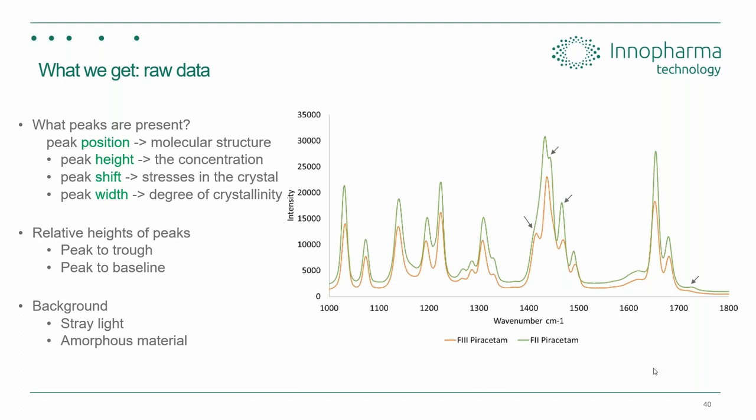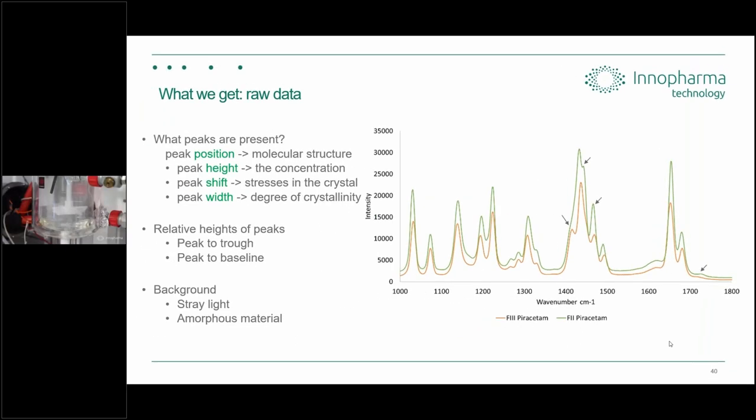Okay, interesting. Right, so what we're starting to see now in our experiment, we'll just switch back to the experiment very briefly. What we're starting to see already is that the solution has become cloudier. The solution has cooled now. We've been slowly cooling it, and at the moment it is at approximately 16 degrees. So what we're seeing here is the start of the nucleation, and that's causing the suspension to become cloudy. What we'll see later on is how this has an influence on the prediction of the concentration. But to get there, we'll allow the reaction to continue and progress.